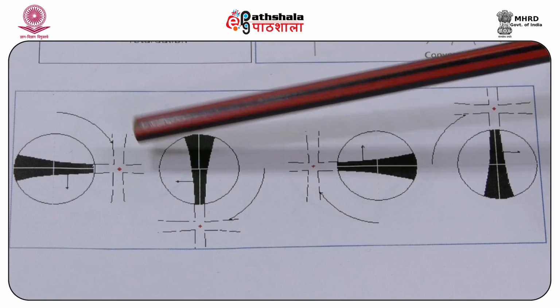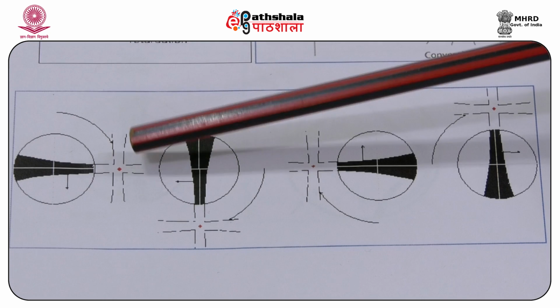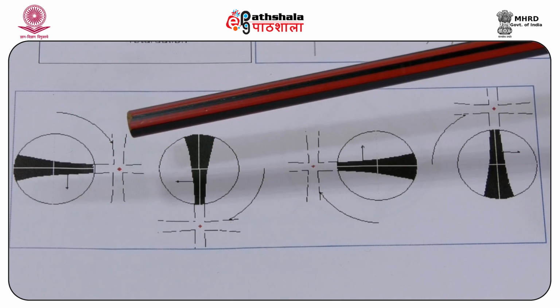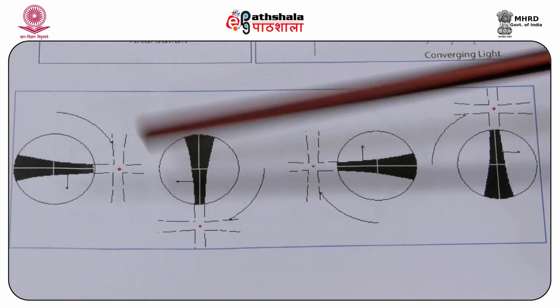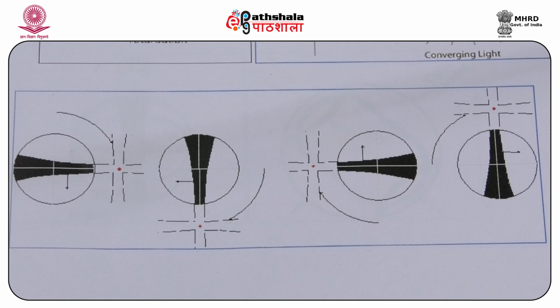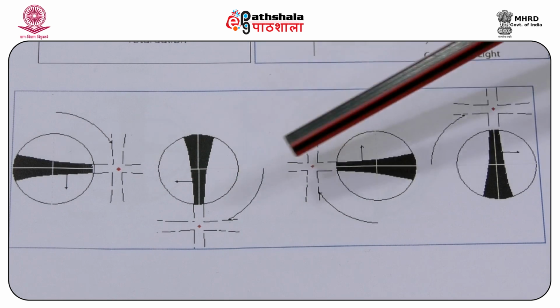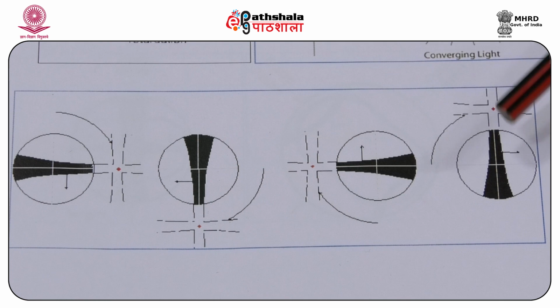If the melatope is well outside the field of view of the microscope, the isogyres sweep across the field of view in sequence as the stage is rotated, with the isogyre always remaining parallel either to the east-west crosshair or to the north-south crosshair. By noting the direction, as you can see here, it is rotating clockwise, here we have the isogyre moving in the anti-clockwise direction.